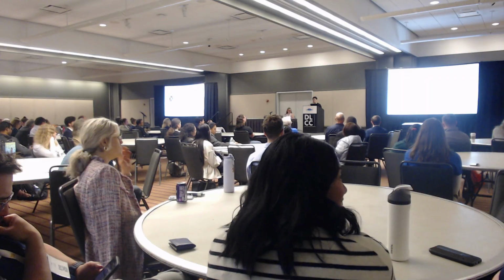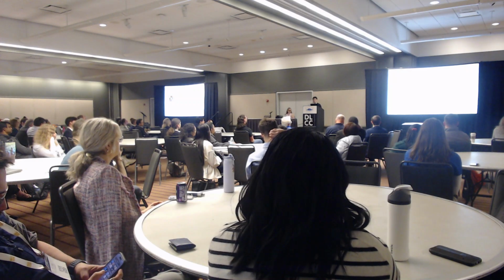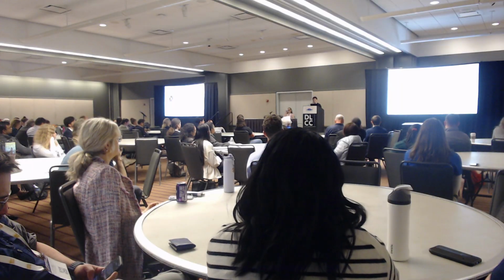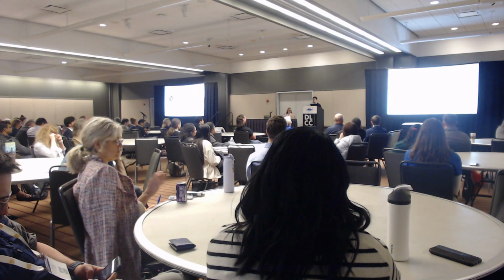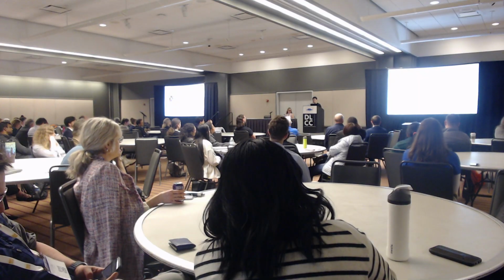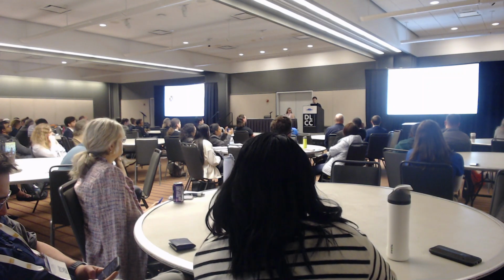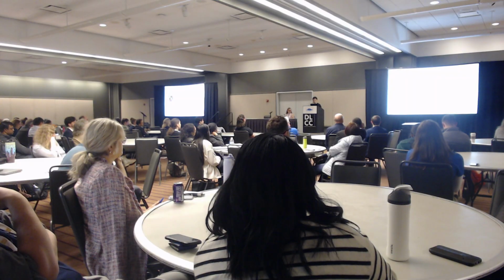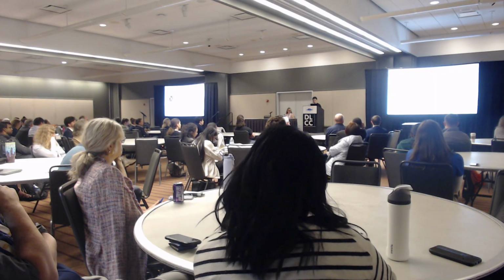With the spatial information, we can do some unique data analysis. For example, we can analyze the spatial neighborhoods at the tissue level, and we can also study cell-cell interactions through ligand-receptor interaction studies. And finally, at the molecular level, we can check the spatially variable genes within the tissue section. So, for example, if we want to study cancer with the spatial information, we can look at how cancer subclones grow in the 3D tissue or 3D microenvironment. And we can look at how cancer subclones interact with each other and also with the tumor microenvironment. Finally, at the molecular level, we can look at how the tumor microenvironment influences the growth of the cancer subclones.